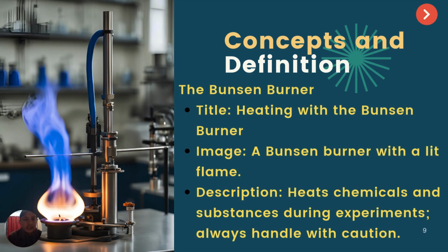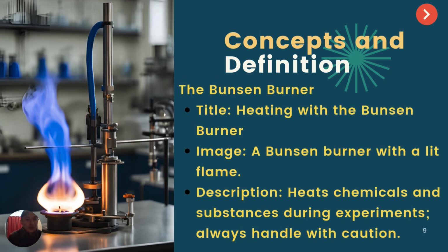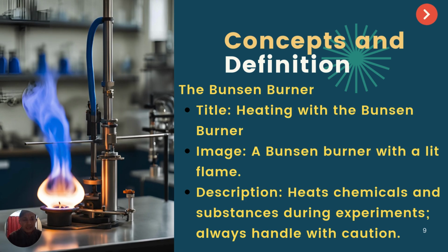And now, dear students, after that, let's have a Bunsen burner. You should be careful with this, because with fire you should observe fire safety. You must know this, and we must have a fire extinguisher nearby. From the Bunsen burner, the flame comes that helps to heat the chemicals and other things when we need. That is the thing you have to understand, but you have to handle it with caution. That is the main important thing.